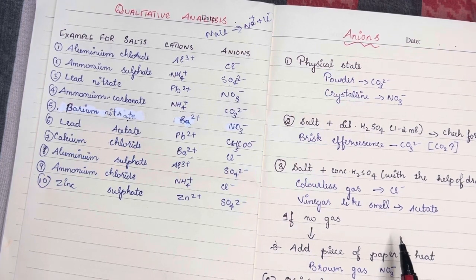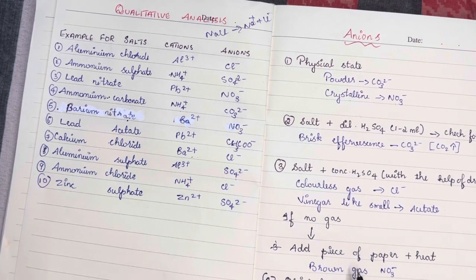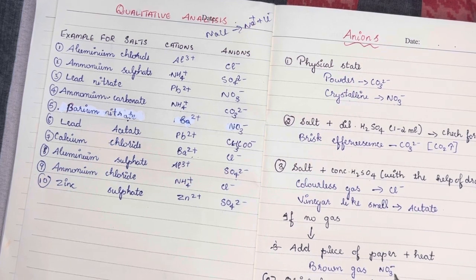And if there is no gas, then to the salt in which we have mixed the concentrated sulfuric acid, add a piece of paper and heat it. When you add the piece of paper and heat it, brown gas will be seen. That confirms the presence of nitrate, that is NO3 minus.